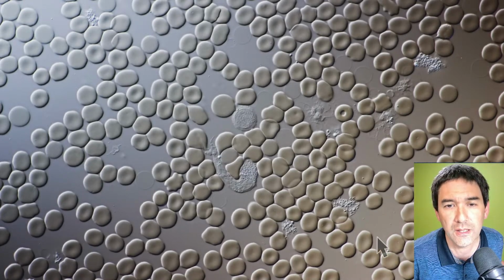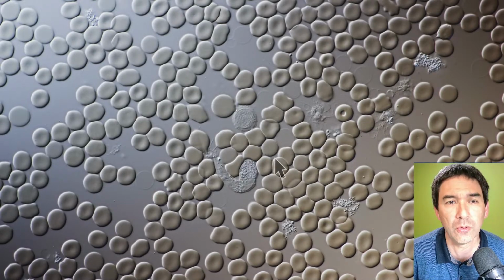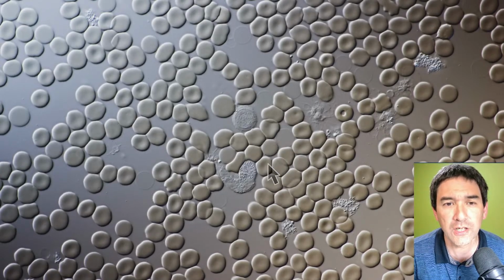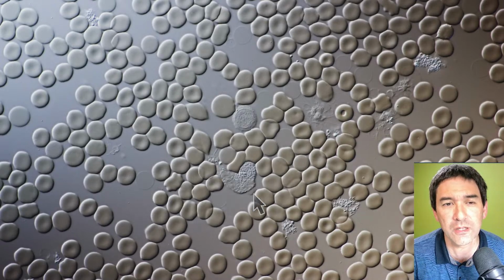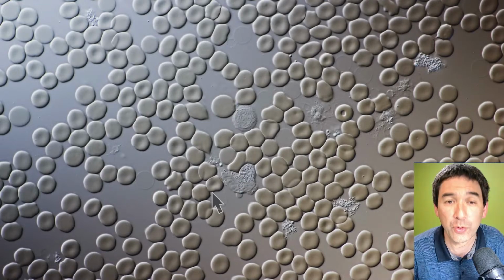It is because I used so little blood that the cells were not able to stack up or move around very much, because they're really compressed between the cover glass and microscope slide. This also means that the white blood cells here were only able to move in one plane and not vertically. So they always stayed in focus.